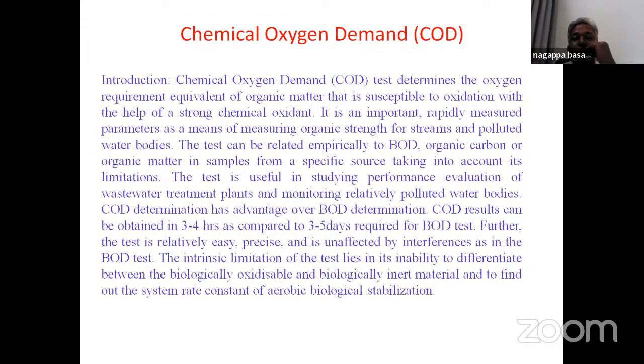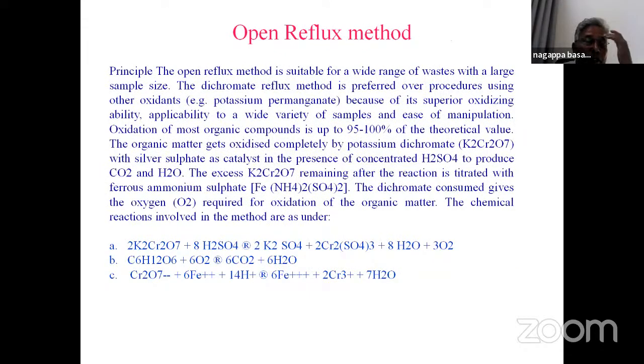Chemical oxygen demand is determined by the oxygen equivalent of organic matter that is susceptible to oxidation with the help of a strong oxidizing agent. This is the theory. This is the chemical reaction.